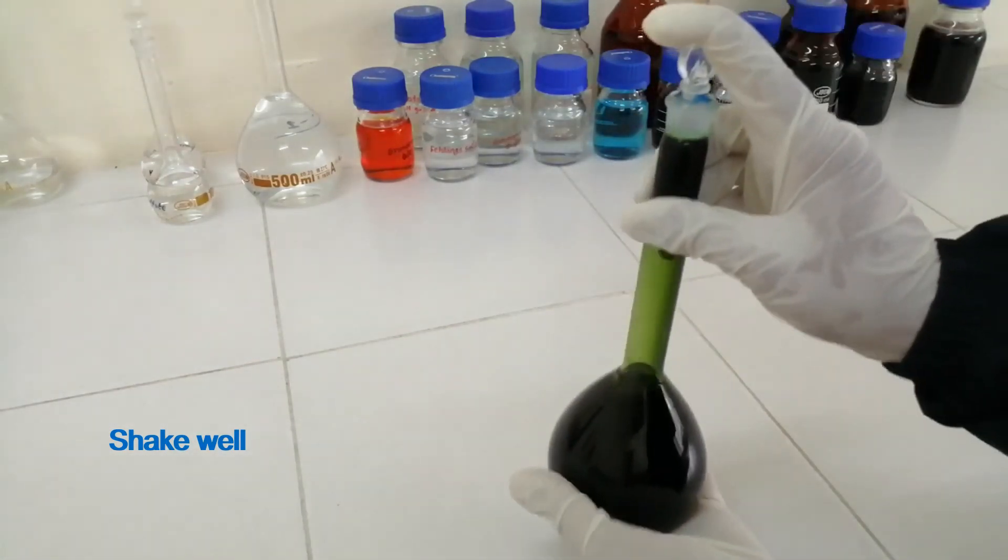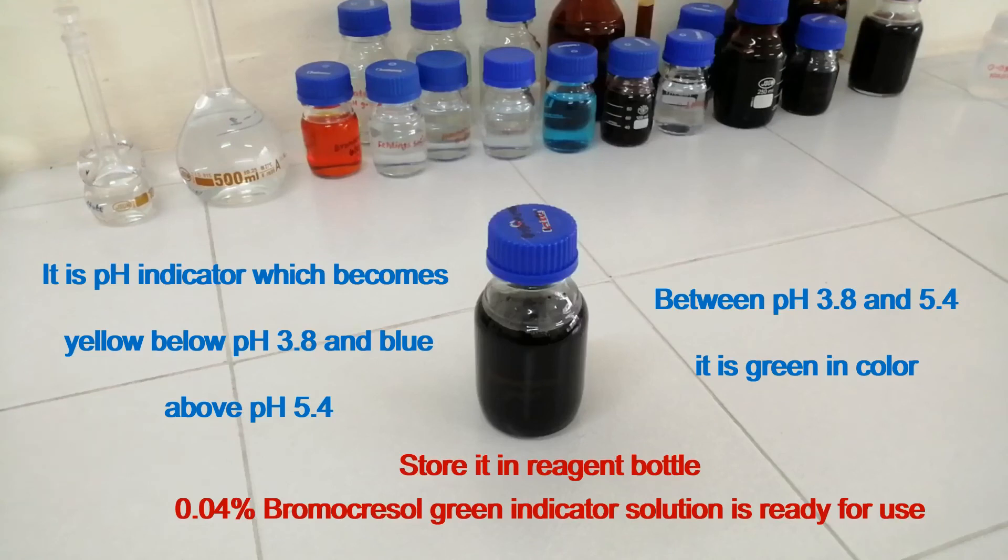Store it in a reagent bottle. The 0.04% Bromocrysol Green Indicator Solution is ready for use. It is a pH indicator which becomes yellow below pH 3.8 and blue above pH 5.4. Between pH 3.8 and 5.4, it is green in color.